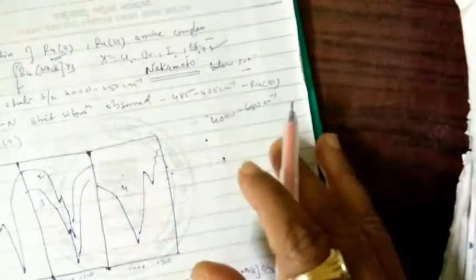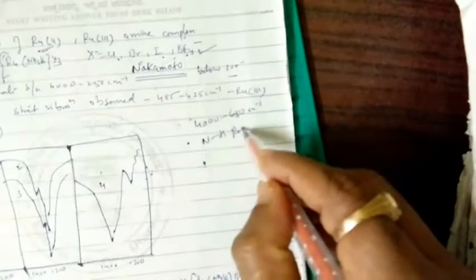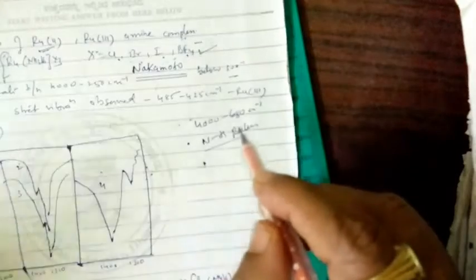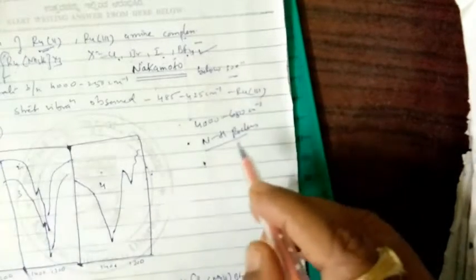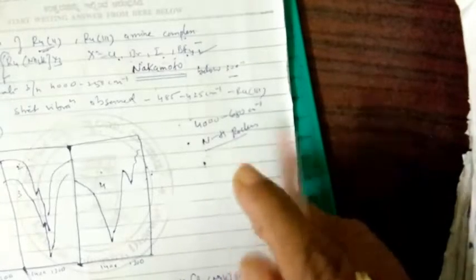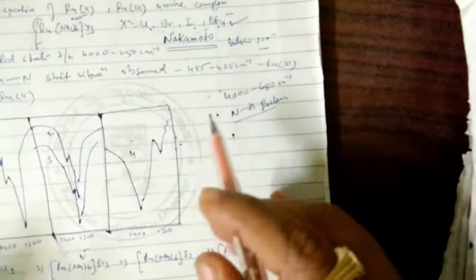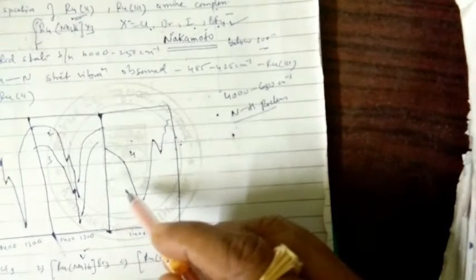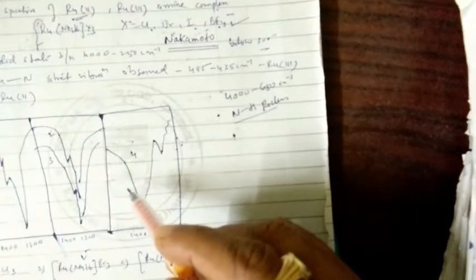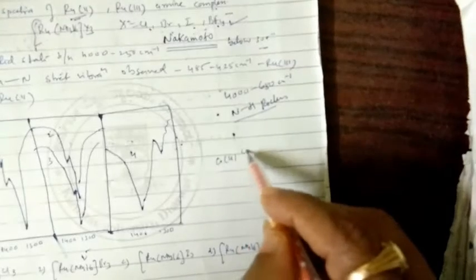The NH3 rocking vibrations for these complexes were very sensitive to a change in the oxidation state of the central metal ion. This was in agreement with the spectra of the examined complexes of cobalt 2 and cobalt 3.